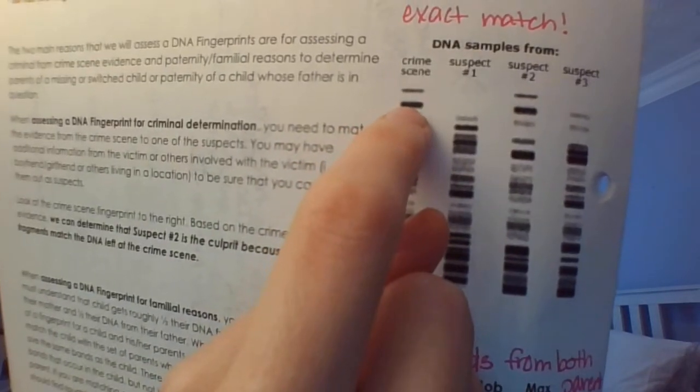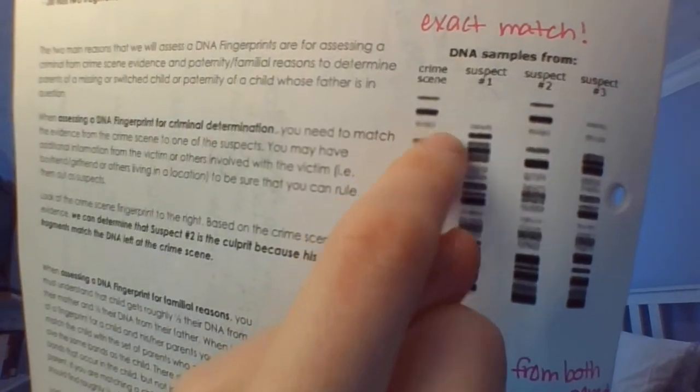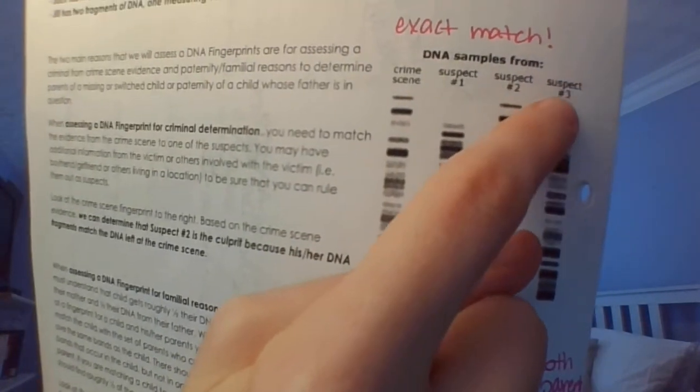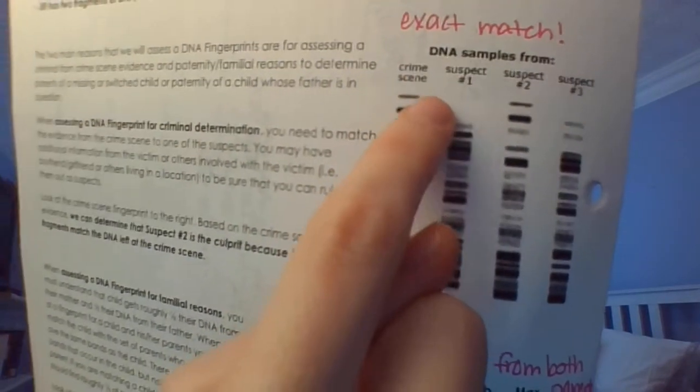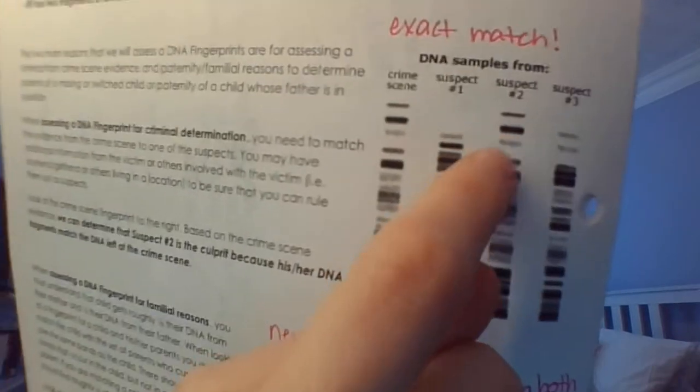Band right here for suspect 2. Band here, you have bands here, but suspect 3 didn't have a band up here, so they're eliminated. Suspect 1 didn't have a band up here where the crime scene did, so they're eliminated. And suspect 2 is the person who did it.